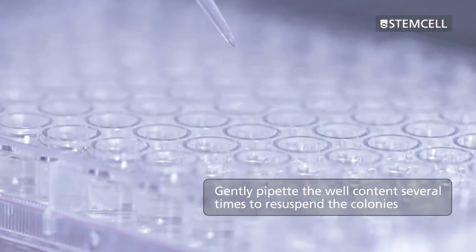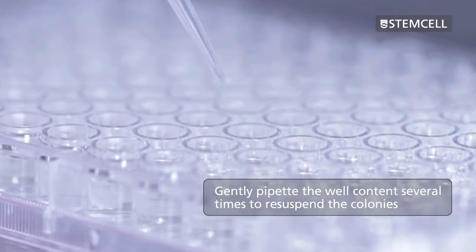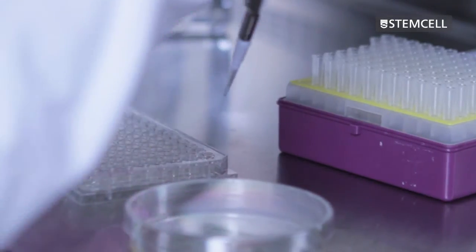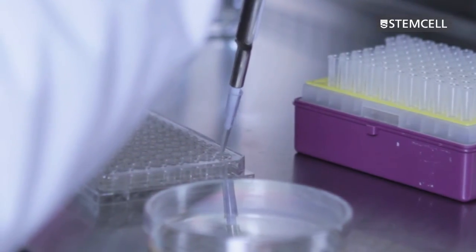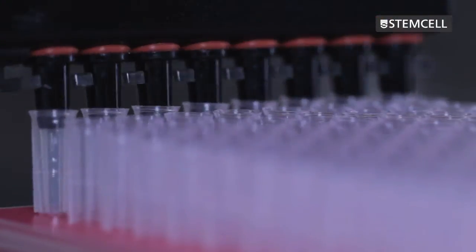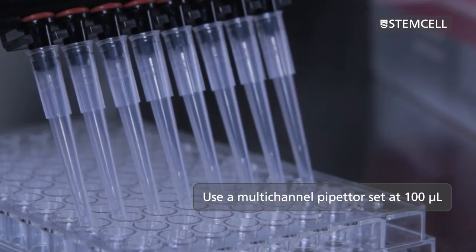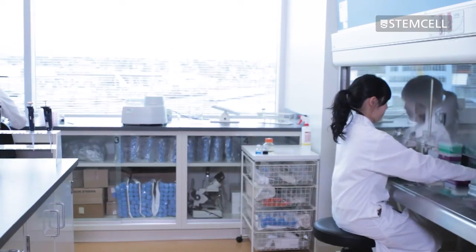Gently pipette the contents of the wells several times to re-suspend the colonies. A single cell suspension is not required, but gently dispersing the colony will promote cell proliferation. A multi-channel pipetter set at 100 microlitres may be used for this purpose after all the colonies have been picked.